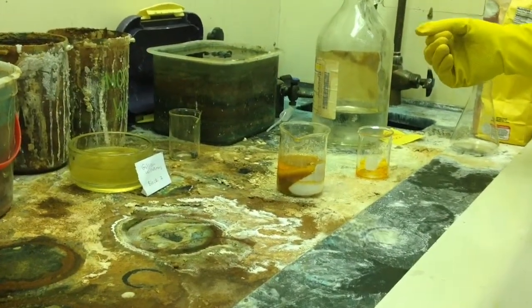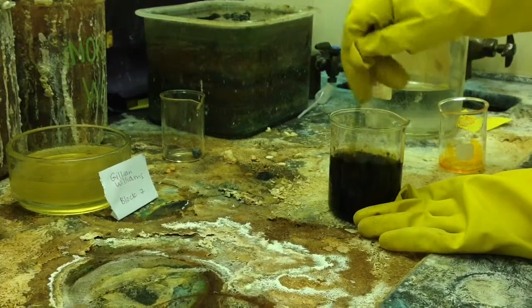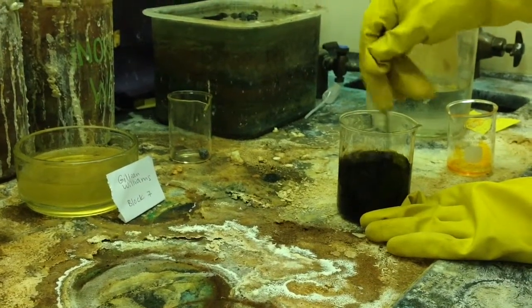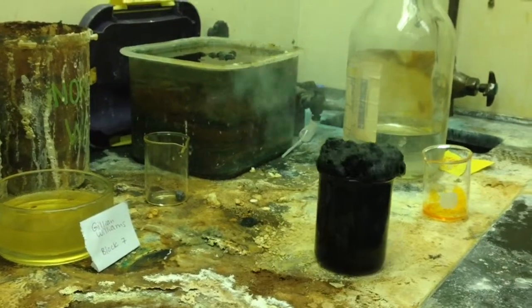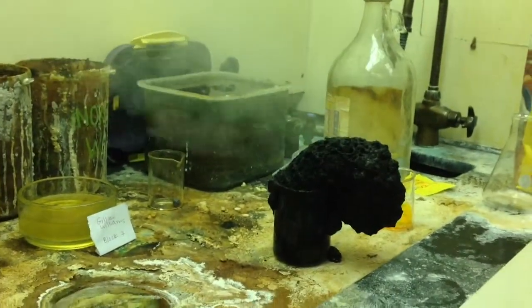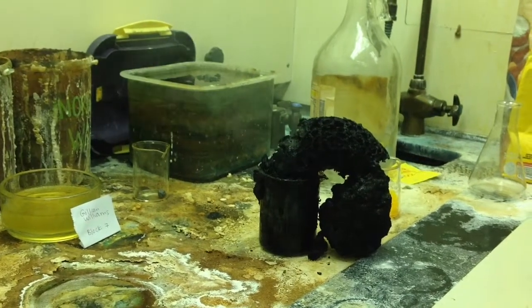As the sulfuric acid incorporates with the sugar, we can see a color change starting to occur. Stirring to incorporate all acid with sugar will speed up the reaction. The substances begin to bubble and finally have enough energy to release some of the water produced in the form of steam, along with some other gases such as carbon dioxide. We can now recognize the black snake, which is carbon in the form of graphite.